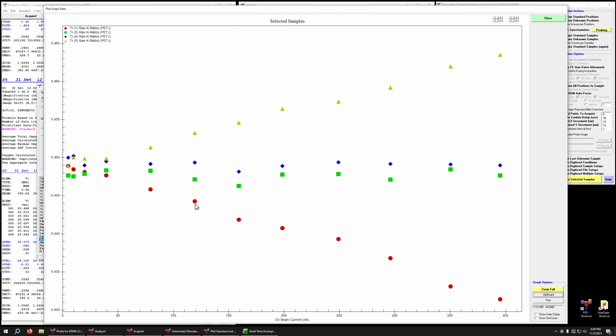And here on spectrometer 1, it's dropping with increasing current, which means our dead time is not sufficient. So we are losing counts as we go up because our dead time value is too high. So real nice. And not so good. So this is something like 2% variation here, maybe even a little bit more, 2 or 3% variation. So that is going to affect your analyses, obviously, if you don't have this right. So we've determined that the dead time on 5 is a little low, the dead time on 1 is a little high. So how do we change that?